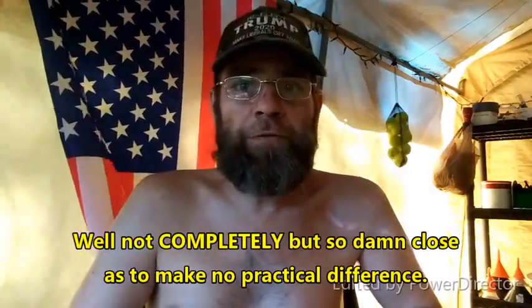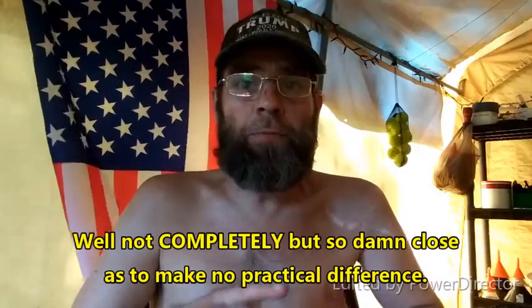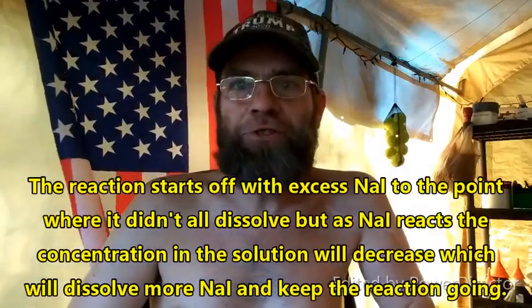The reaction can convert either alkyl chlorides or alkyl bromides into alkyl iodides, and the reason that it works is because the reaction is carried out in acetone. It is a marvelous demonstration of Le Chatelier's principle. Sodium iodide is soluble in acetone, but sodium bromide and sodium chloride are not. So as they are produced, as the reaction goes, they precipitate, which removes them from the system as a solid crystal. Because you are removing a product, the reaction gets dragged to the right. So I thought it was exceptionally cool.